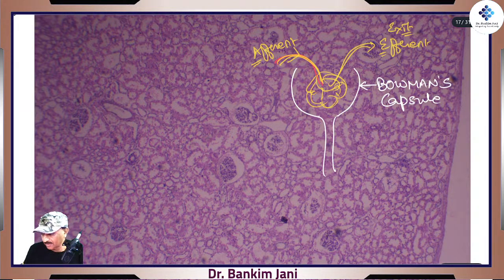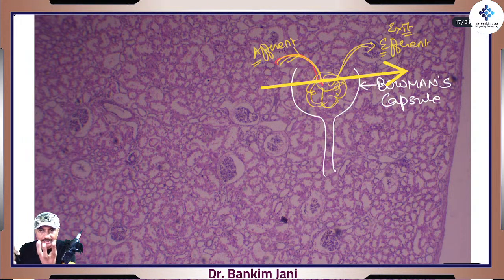So we are now taking a section of this. Watch it. When we take this section, how would it look? Like this, a cup. Inside there are capillaries. You take a section, so you will be watching this white one, the boundary like this.